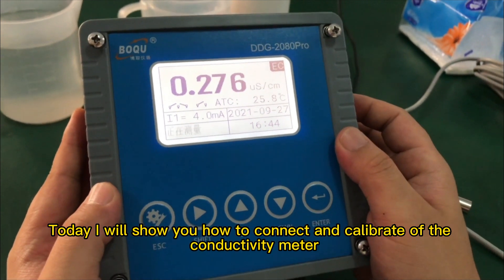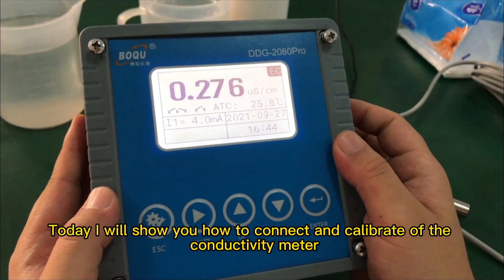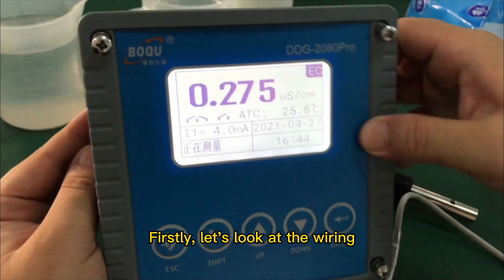Today I will show you how to connect and calibrate the conductivity meter. First, let's look at the wiring.